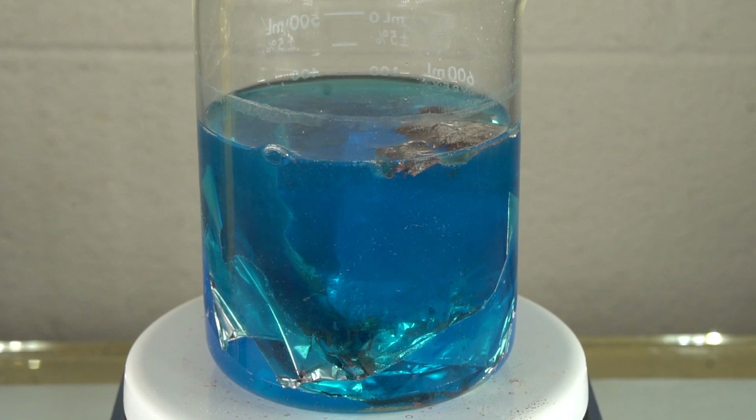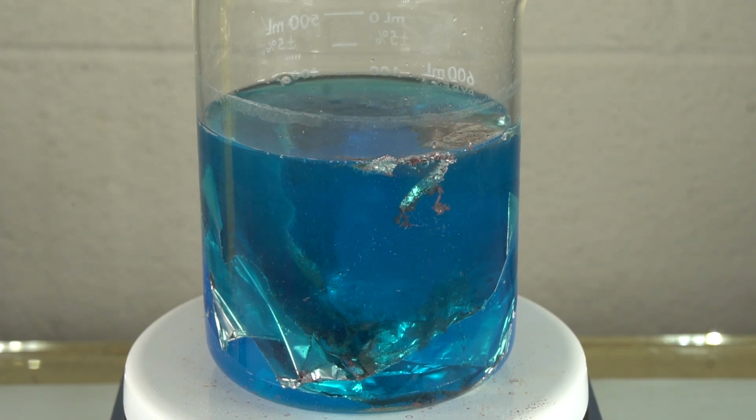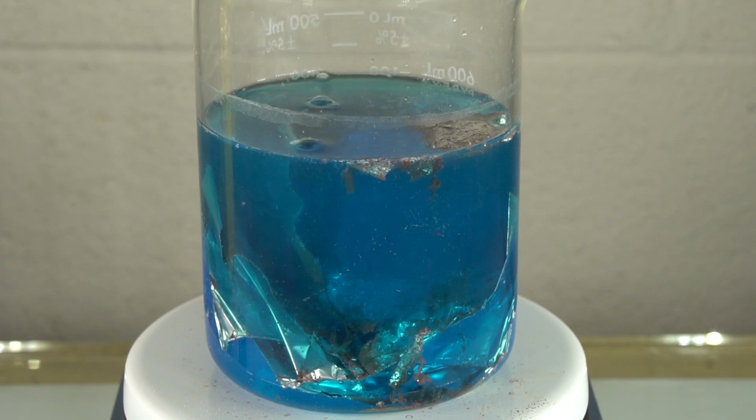If you want to see how reactive aluminum actually is, in another experiment on the ChemTalk YouTube channel, we combine it with gallium into an alloy, and gallium penetrates the crystal structure of aluminum and allows it to react with water and produce hydrogen right before your eyes. It's really incredible. Now, there is a little bit of bubbling in here.